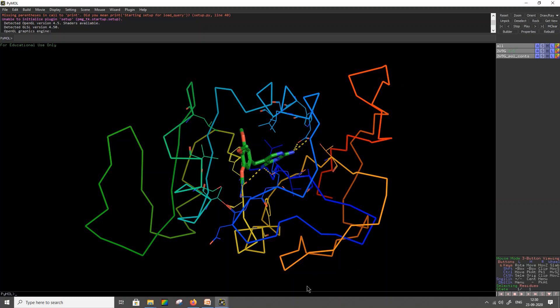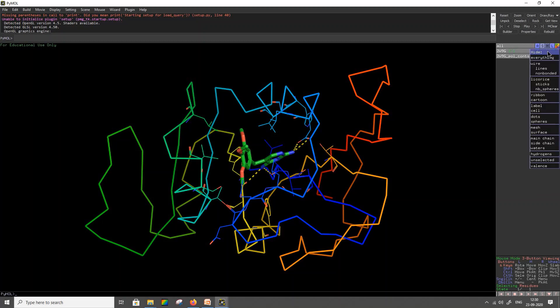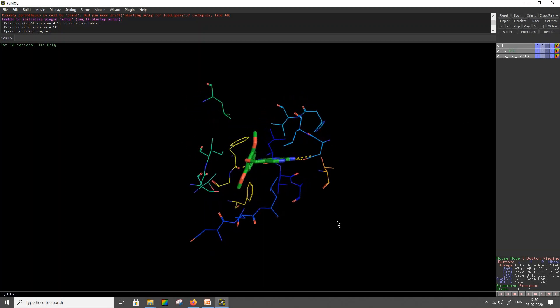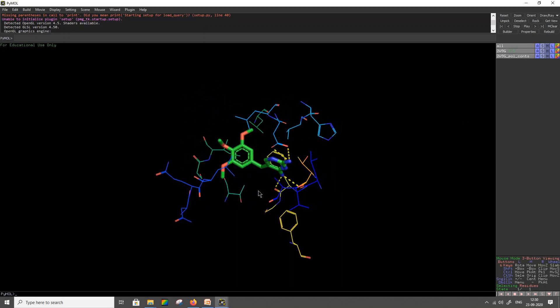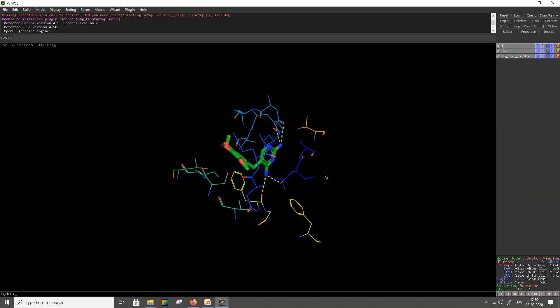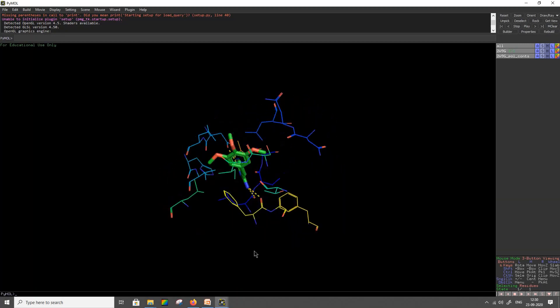The backbone of the protein will be represented in ribbon structure. To eliminate these non-interacting amino acids, click on the Hide H icon, then select Ribbon. This will remove the backbone of the non-interacting amino acids. Now you are seeing the structure of all the residues — the amino acids that are interacting with your ligand.